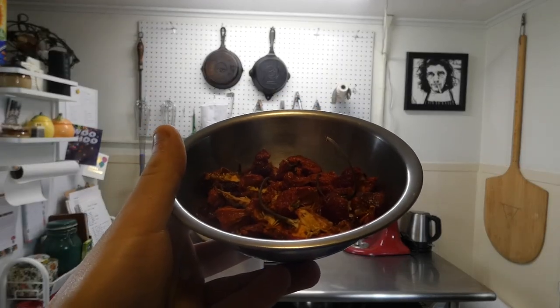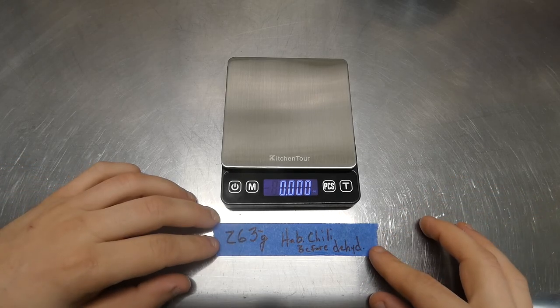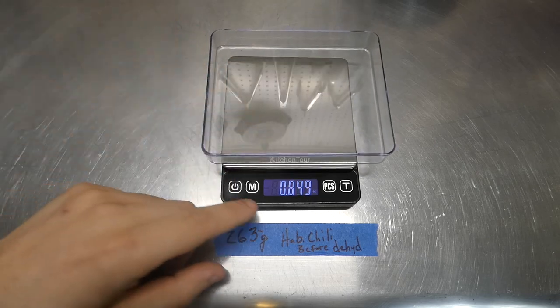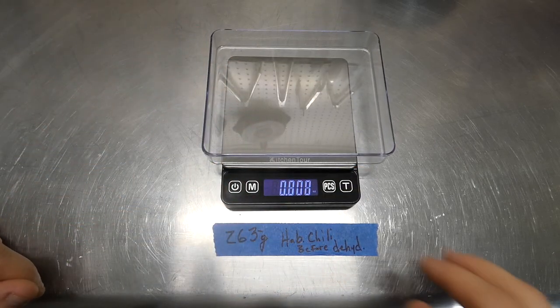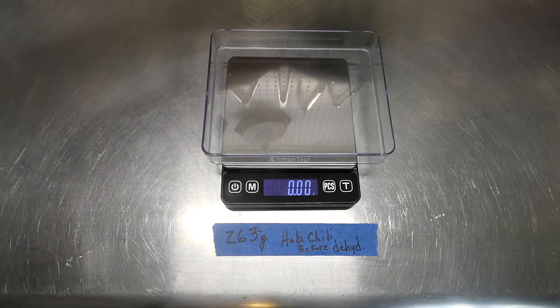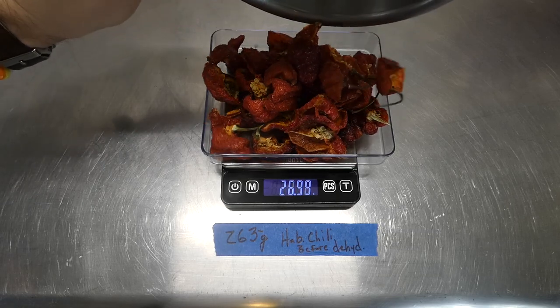All right, so we finally have the chilies dried, as you can see here. And now we're just gonna weigh these out, see how much the dry weight is, and we'll calculate what the yield was. The weight before we dried them was 263 grams. Just gonna pop that on there, tare it out, and change the mode to grams. And we're just gonna pop these in, seeds and all.